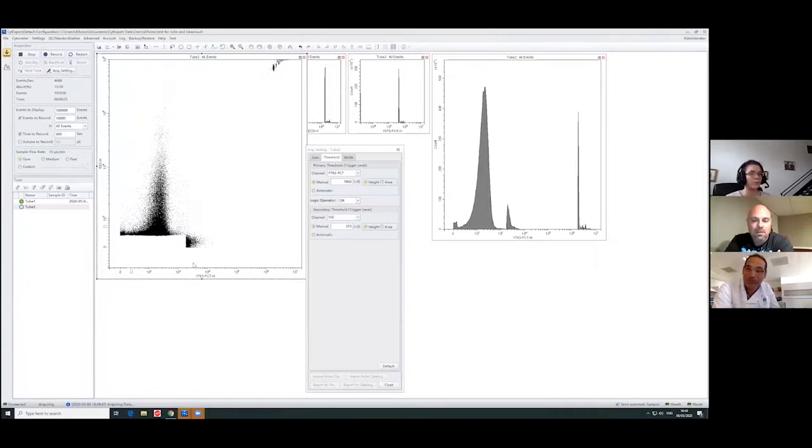John? Yeah, this is what we were talking about previously, where I said I like to look at everything with the fluorescence, depending on what sample they give me. Speaking with you, we've been trying all these different thresholds and combinations to get a clearer picture. Like you said, it tells us which ones have actually labeled correctly, and what other ones we may have that separate out of the noise. So you get a more clear picture.